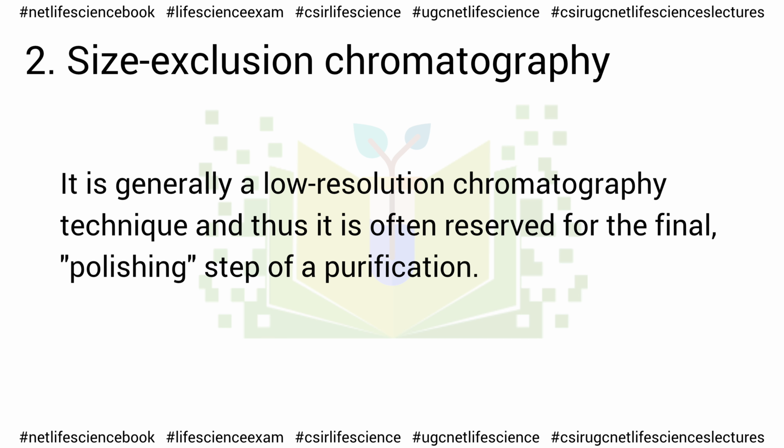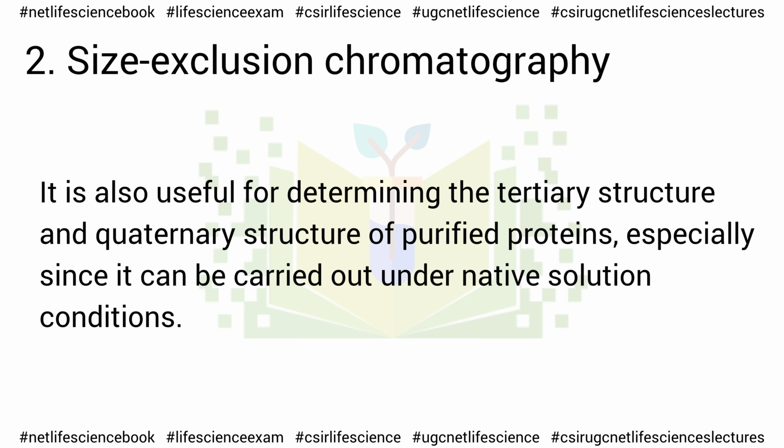It is generally a low-resolution chromatography technique and thus it is often reserved for the final, polishing, step of a purification. It is also useful for determining the tertiary structure and quaternary structure of purified proteins, especially since it can be carried out under native solution conditions.